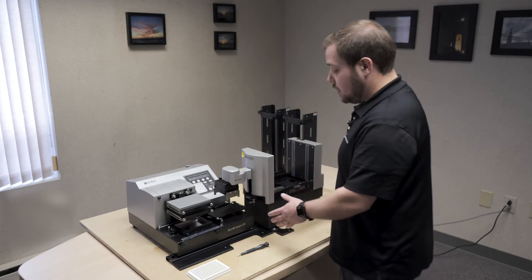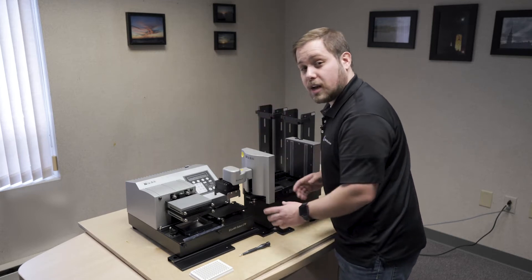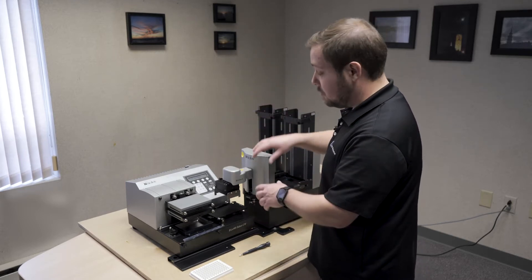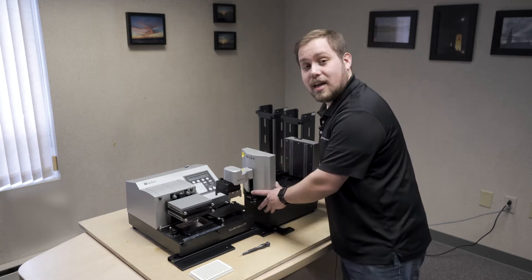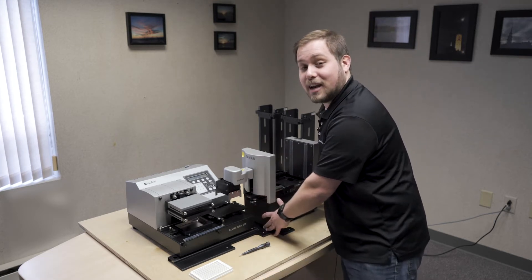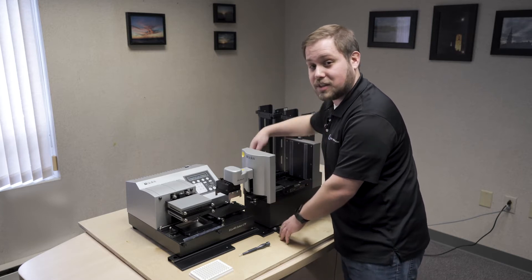From this position, you can get a basic idea as to how the gripper is aligned to the plate carrier. We want to try to get it as close as we can from this height before we get down to the actual teaching of the position. That can be done by moving the stacker back and forth across the mount position by loosening the two flathead screws on either side of the stacker.